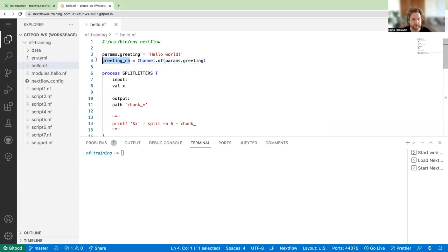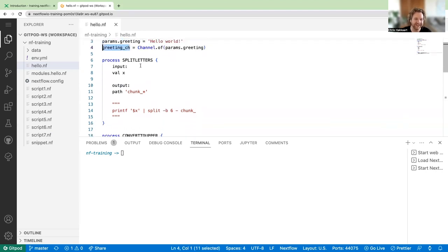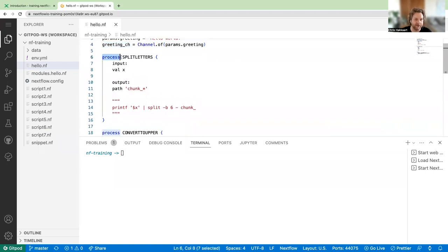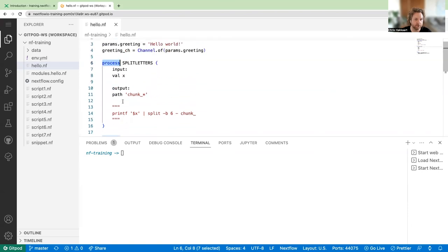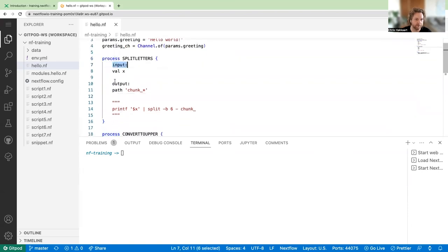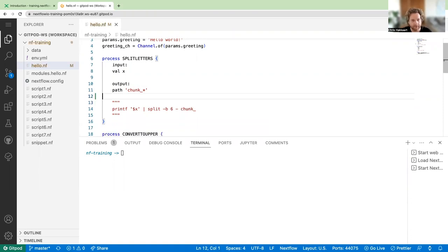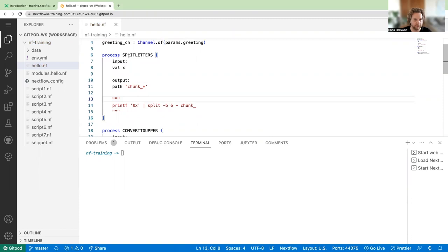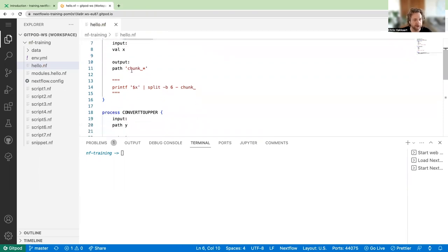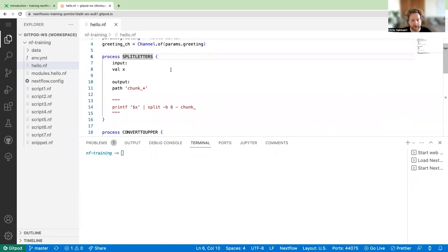Line six is the start of our first process, and line 18 is the start of our second process. Each process has an input, output, and a script block. For the first process, 'split_letters', we have an input of type 'val x' and an output path 'chunk_*' — so anything with the prefix chunk_ will be picked up as output. Paths are generally used for files and folders, while values are more for strings. Process names like 'split_letters' are somewhat arbitrary but should be identifiable within a larger workflow.